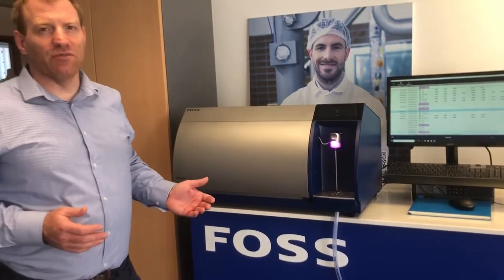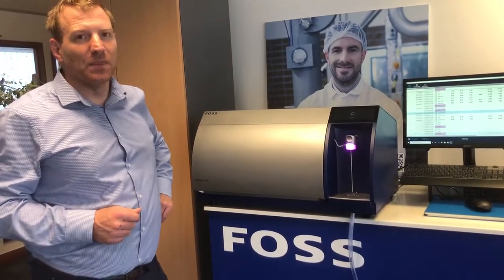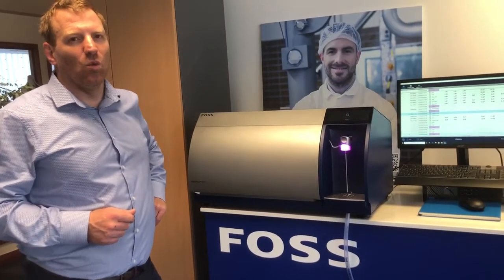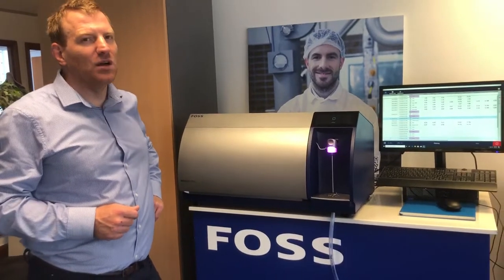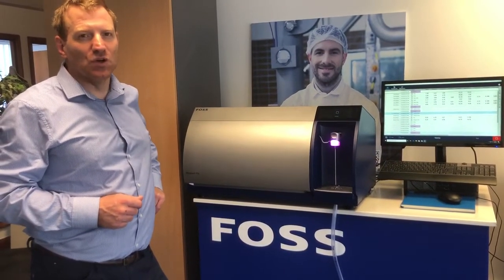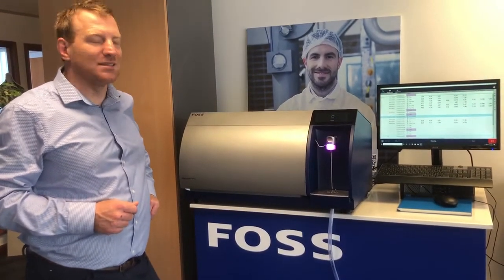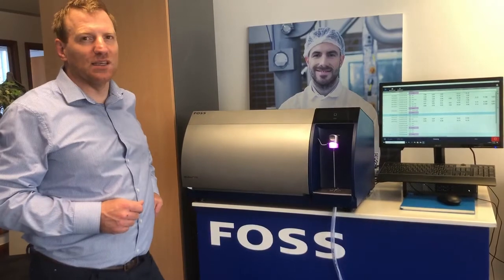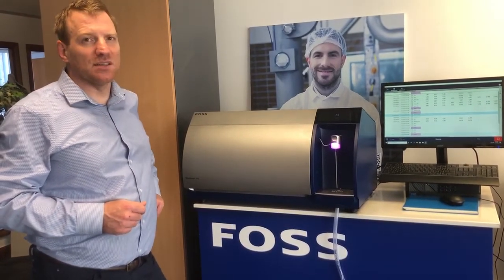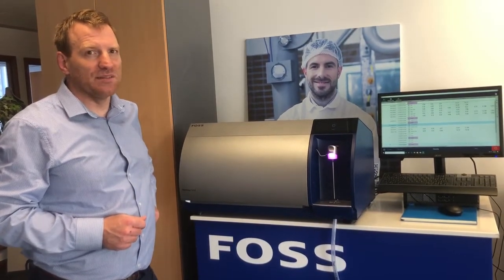Internet connectivity gives transferability — because every MilkaScan FT3 is the same out of the factory, you can now calibrate one instrument in a network and send that calibration to multiple sites. For large companies with lots of sites and lots of milk analyzers, that can give you great savings. If you want to have a chat about the MilkaScan FT3, just contact one of your local FOSS representatives.